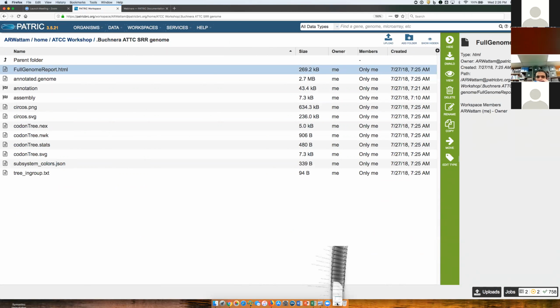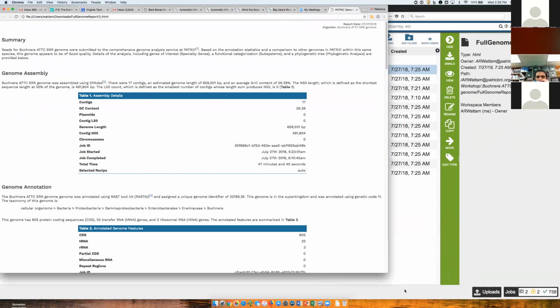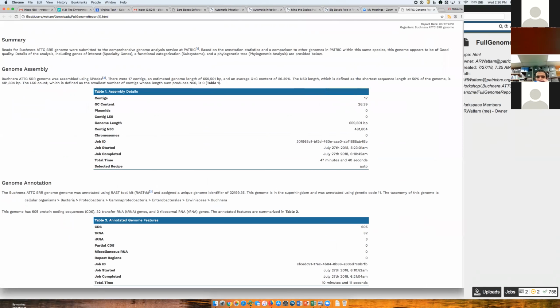Let's see, here are my downloads. Click on this. And here is the full report.